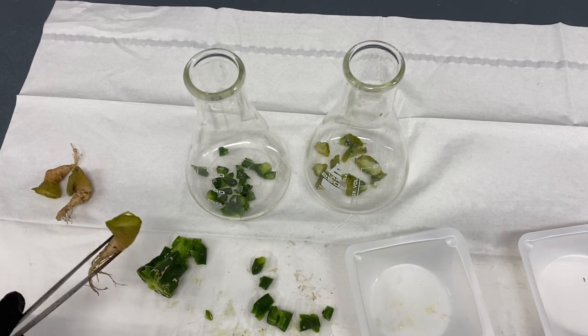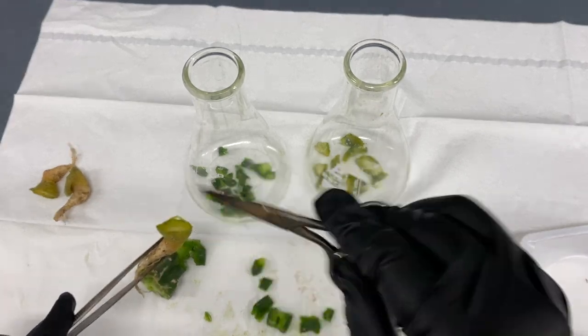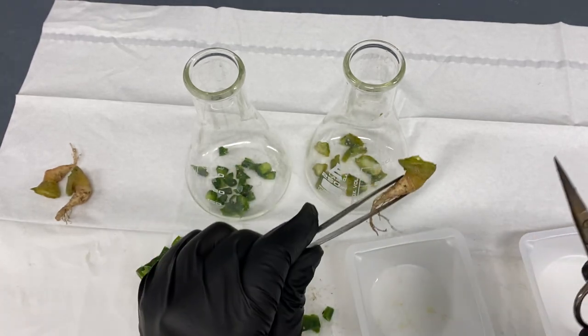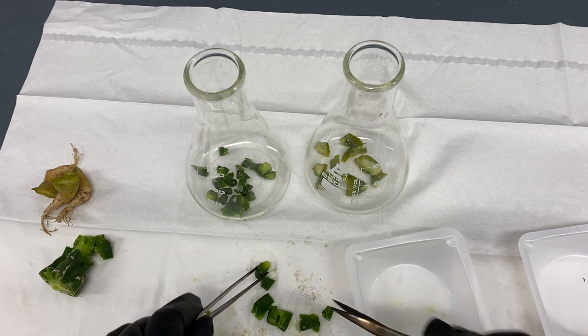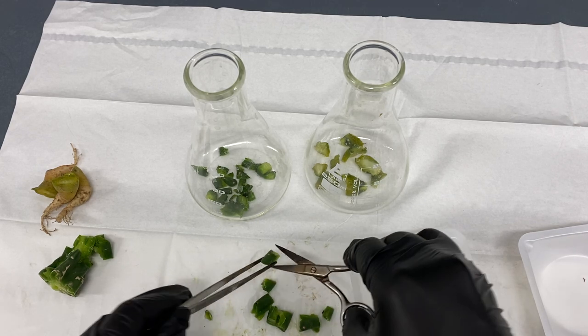That's how you process tissue for columnar cactus and for any type that has a tuft — an areocarpus would be the exact same way. You cut it off, separate all the tuft areas, and then put it inside the media.